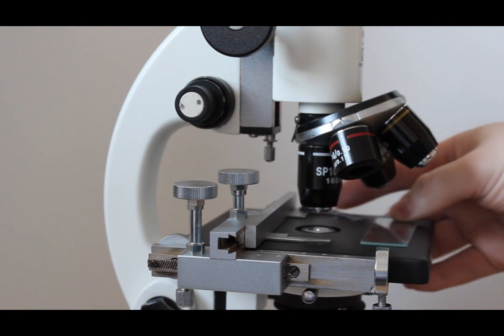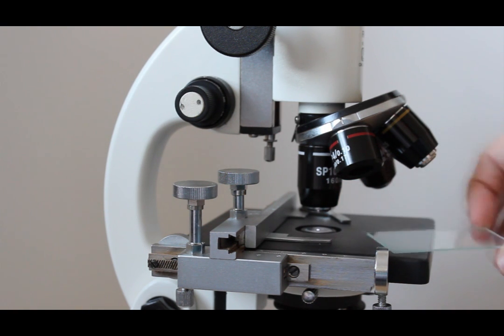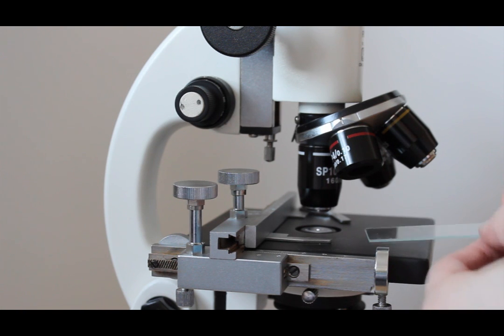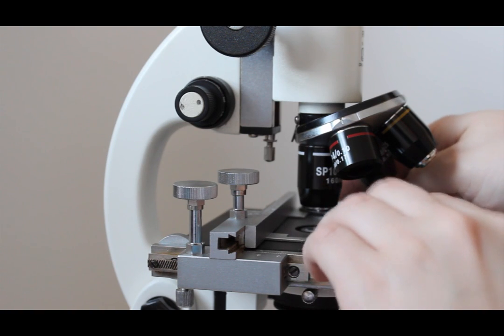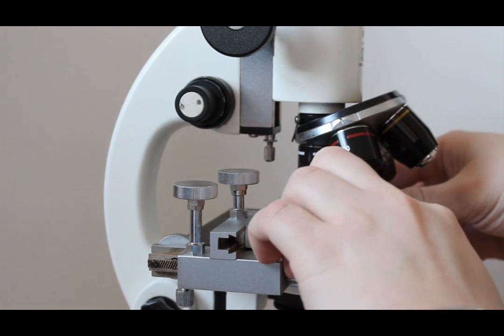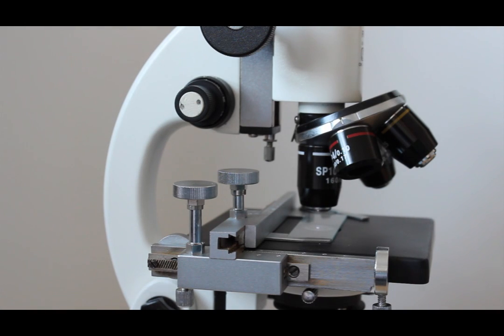So you would take the immersion oil and you would, obviously you'd have a cover stuff on this, but you drop the immersion oil on, one tiny drop, put it back and then you would gently lower it down until the actual objective lens comes in contact with the immersion oil.